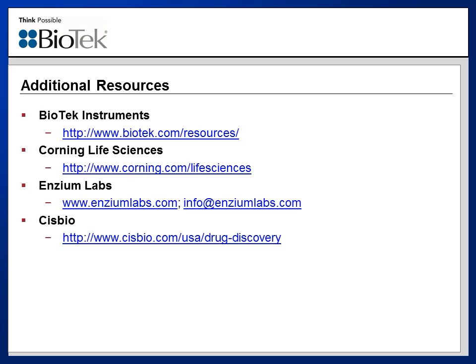So the answer is yes. It's important to remember that for centrifuging the microplates, the centrifuge should be cooled down. If you've ever had to use Matrigel, you'll know that it's extremely important to keep the matrix cool so that it does not begin to gel prior to when it's been properly positioned within the well. So the centrifuge was cooled down to 4 degrees Celsius prior to the centrifugation process.